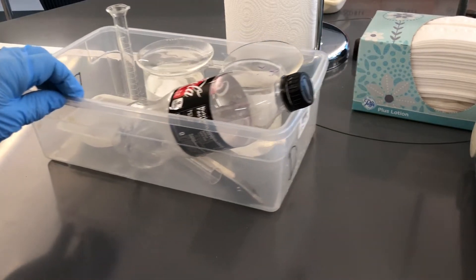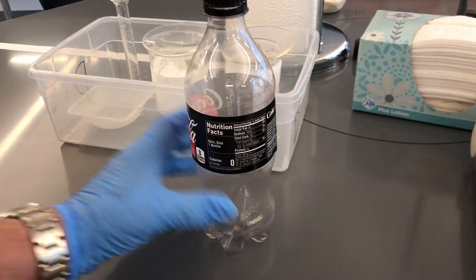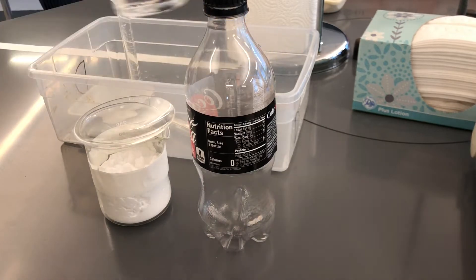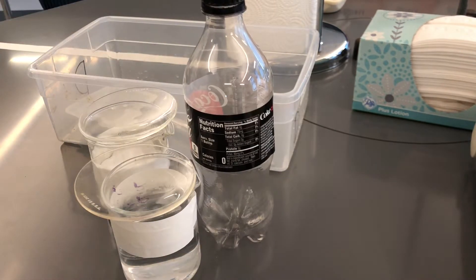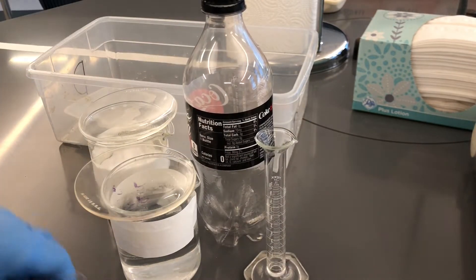We're going to try the experiment. First thing, let's get all the equipment out. So we've got a Coke bottle, a beaker of baking soda, a beaker of vinegar, we've got our graduated cylinder, we've got a test tube and a scoopula.